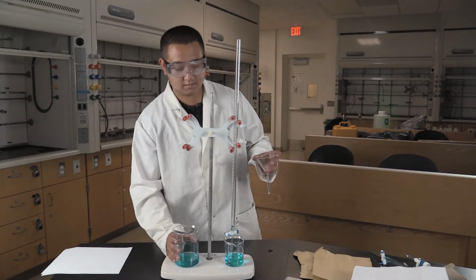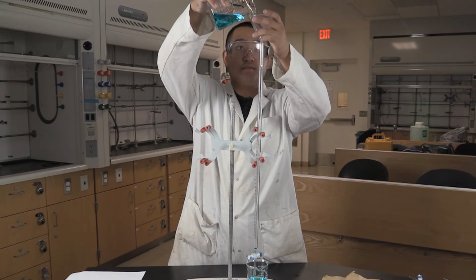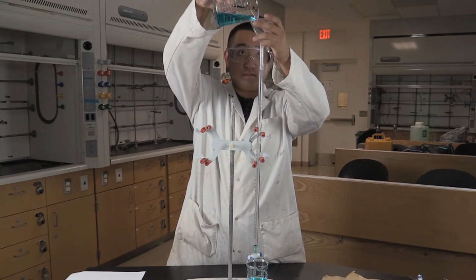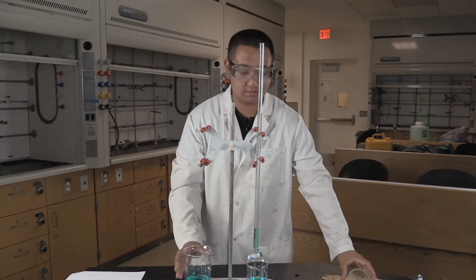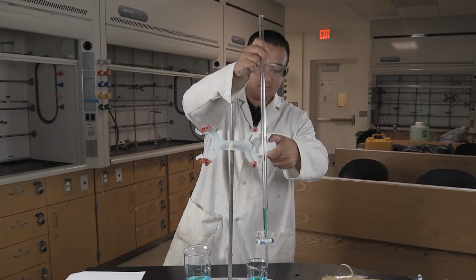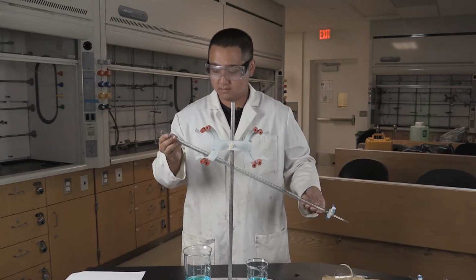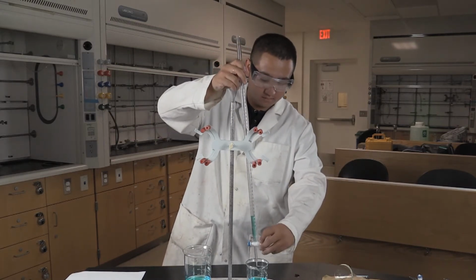The first thing we need to do is condition the burette. Start by closing the stopcock and adding a few milliliters to the burette. Now take those few milliliters and rinse them around back and forth to wet all the surfaces on the inside of the burette. Be sure to keep a waste beaker handy to collect your rinsings. Also, be sure to run a little bit through the stopcock as well.